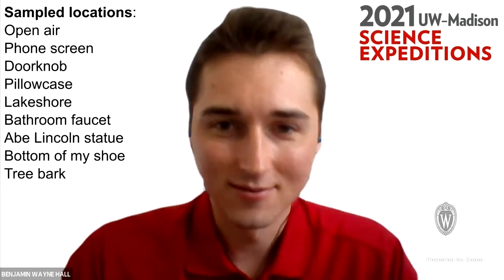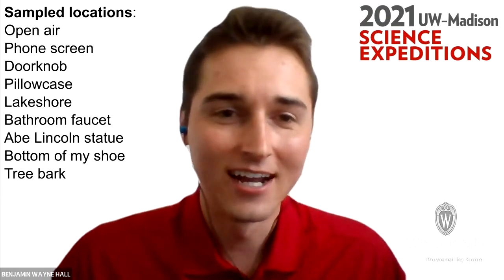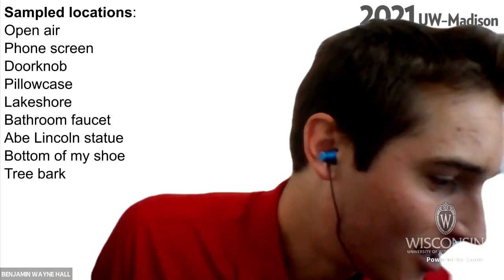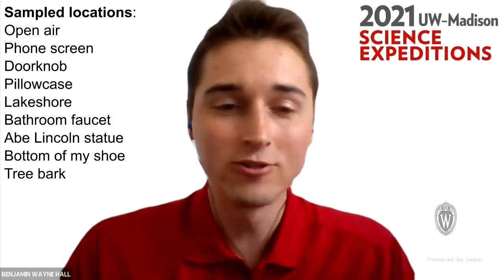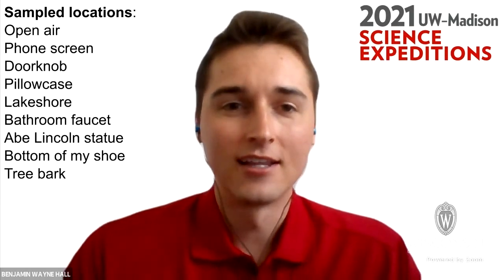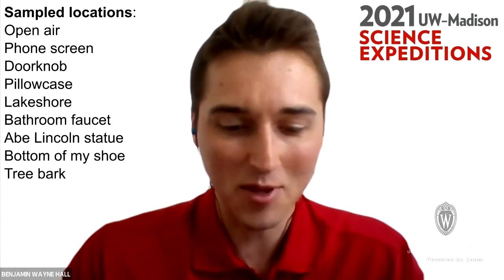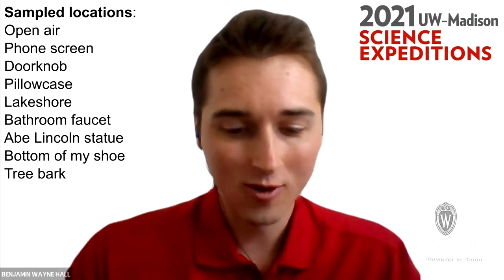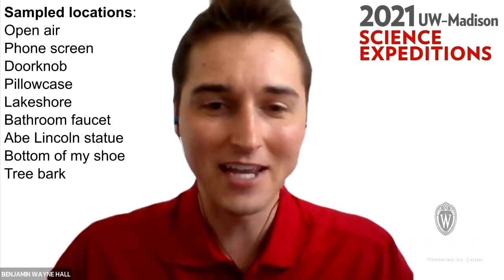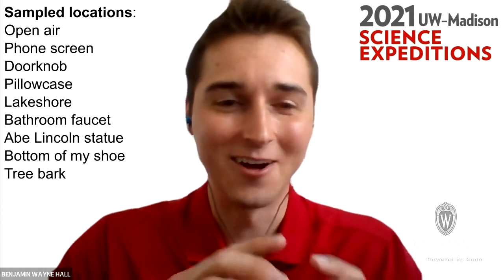No more yet. Okay, so I think let's start taking a look at these different plates. We had multiple people that guessed the phone screen would have a lot of bacteria, and this was a really popular place from the survey that people wanted me to test. So here is what the phone screen looked like, and I have to hold it in front of my face or else it disappears if it's out in the open.